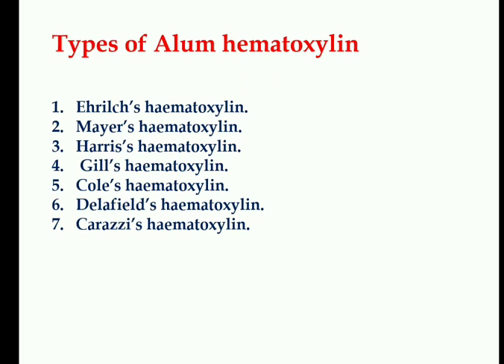The alum hematoxylins are Ehrlich's hematoxylin, Mayer's hematoxylin, Harris hematoxylin, Gill's hematoxylin, Cole's hematoxylin, and Carazzi's hematoxylin. Mostly in the laboratory, we use Harris hematoxylin.